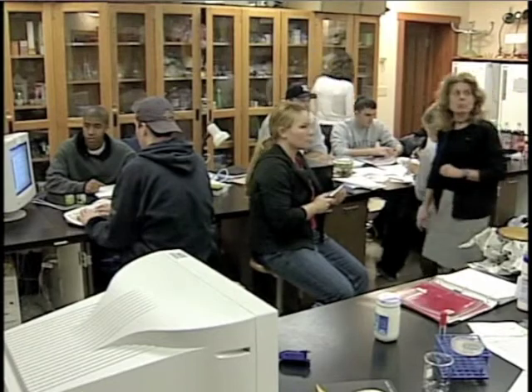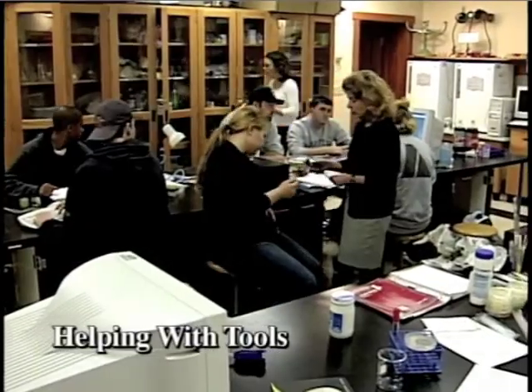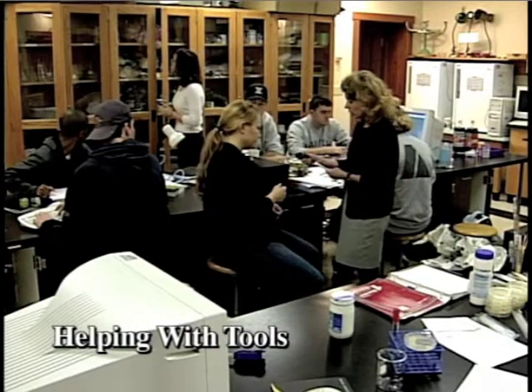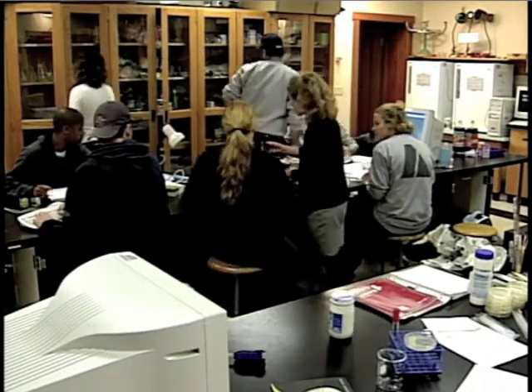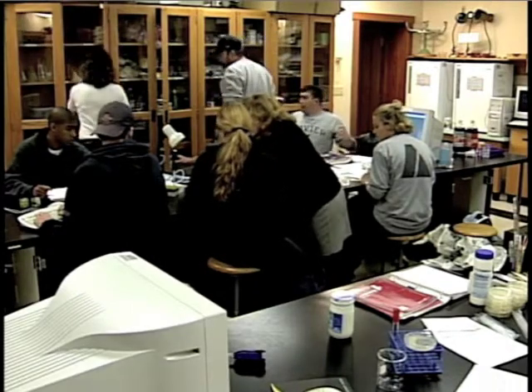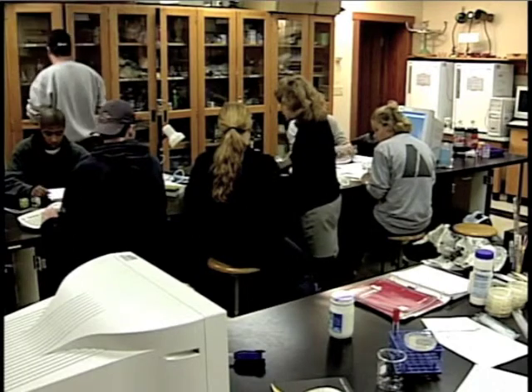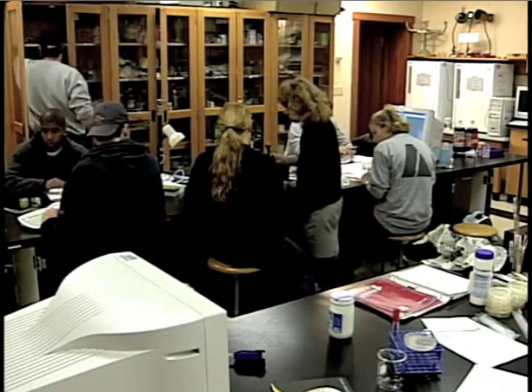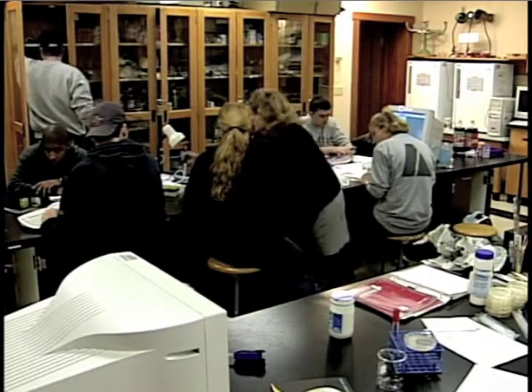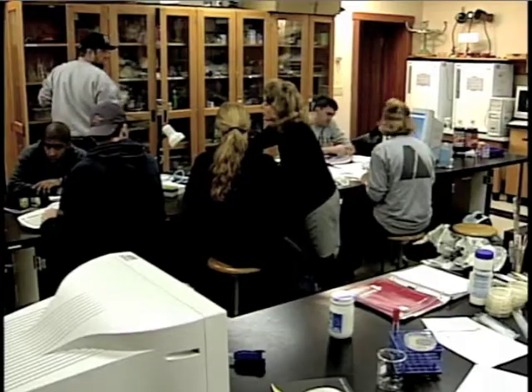We have about 20 minutes to work. Yes, you do need instructions on this. This, as I said, was a micropipette. This smaller one should fit this tip, I think. No, maybe I'm wrong. Or maybe he didn't give you the right tip size. No, that's not right. This is too big. Okay, that fits that one. Did you want smaller than this?